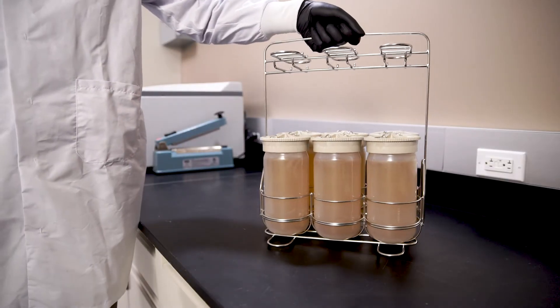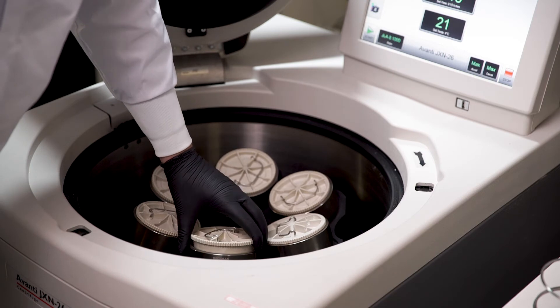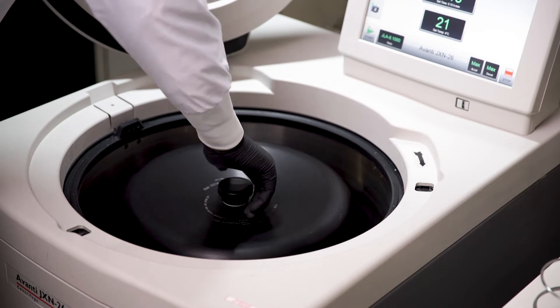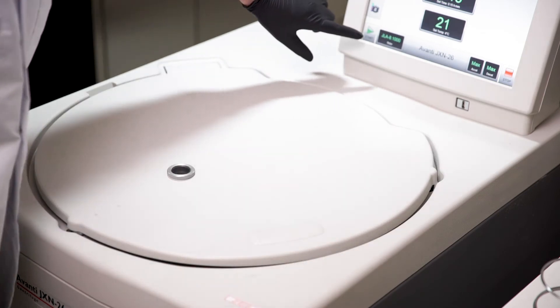After filling and balancing all the bottles for the run, we are ready to spin the sample. Place the bottles into the rotor per the rotor and centrifuge instructions for use. Be mindful of how you orient the liner, as some applications may benefit from the pellet forming on the flat liner surface away from the seam. This is achieved by orienting the liner flat side facing outward.